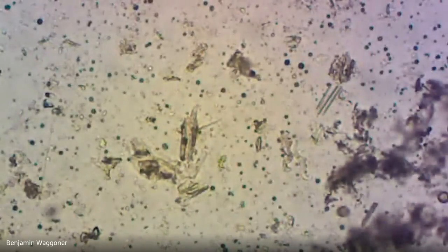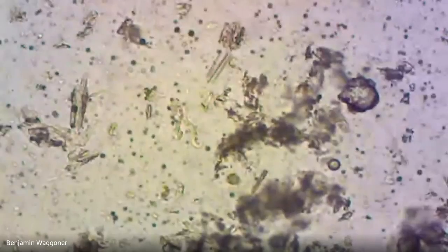Okay, I've lost them. Give me a sec. Okay, right there, you can see these elongated things that are twitching and writhing just a little bit.